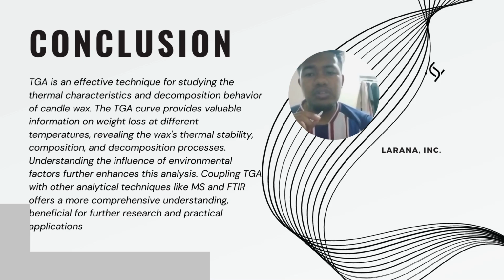Understanding the influence of environmental factors is a future direction for analysis. Coupling TGA with other analytical techniques like MS and FTIR offers a more comprehensive understanding, beneficial for further research and practical application.